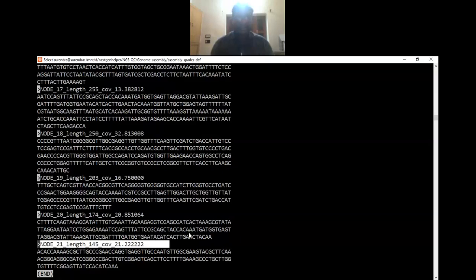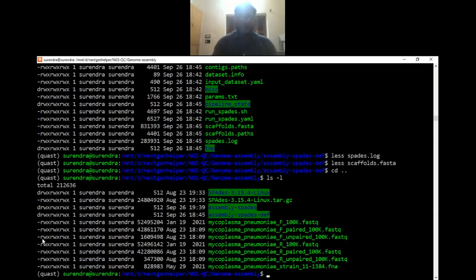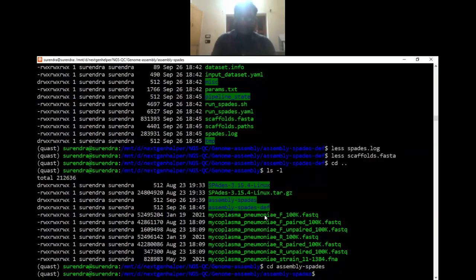Okay, 21 sequences in the defined K-mer, where we have selected different number of the K-mers. Okay, we have total 21 sequences. If we go back to the default assembly of the SPAdes, so you will see here the drastic difference in the same tool, but with change in few parameters only.